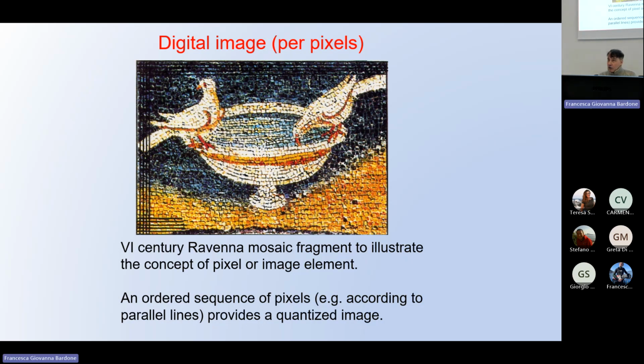The scanning electron microscope works in this way. So the beam hits the specimen in one point, takes the information, then the beam moves one pixel aside, takes the information, another pixel aside, takes the information. And then you have a line. And then you have a 1,000 lines, 2,000 lines, whatever lines you want. You can select whatever you want. So the image is digitalized, is scanning, because your beam is scanning over the surface. And from every pixel takes the information.